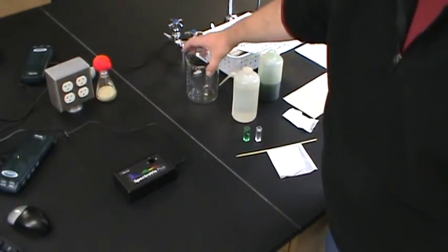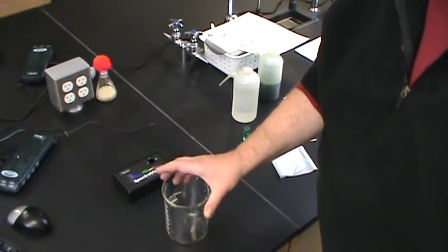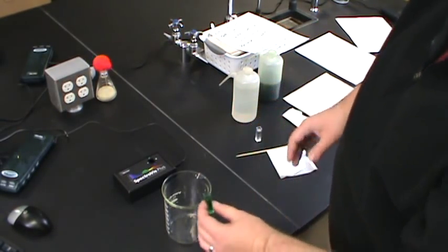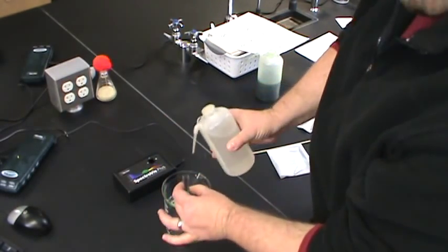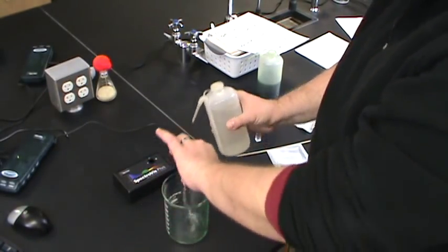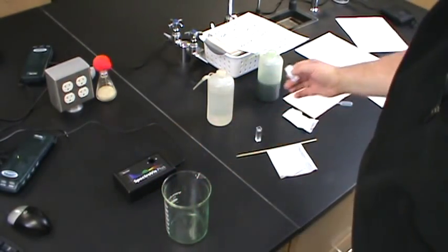One of the most useful things to have around whenever you're doing lab work like this is really just a very large beaker. You're going to have a whole bunch of different little samples that you're going to want to dump out, so rather than running back and forth to a sink, it's always pretty convenient if you just have a large beaker. For these samples, you can mix them, give it a couple rinses, and that cuvette is cleaned out and ready to go. And that's really all there is to recording a spectrum.